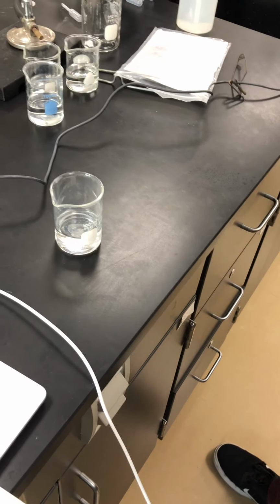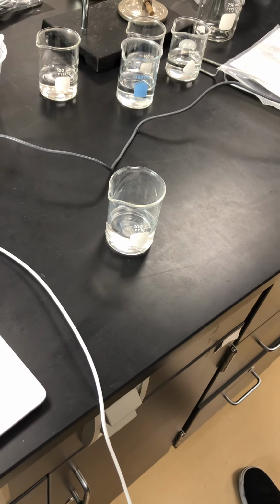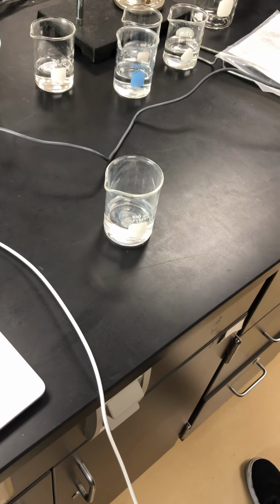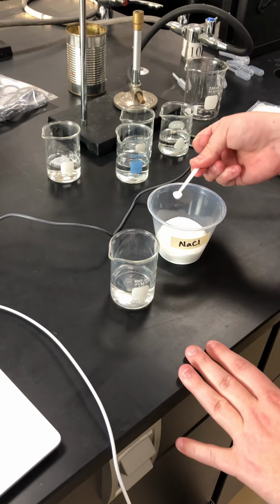I'm going to be testing our known chemicals and our two unknowns to decide if they will dissolve in water, and then I'm going to test that solution to see if it will conduct electricity. The first one I'm going to test is sodium chloride. I'm going to put in 4 little scoops.